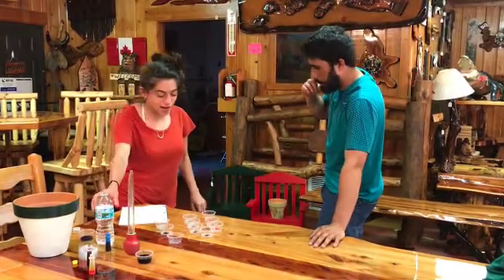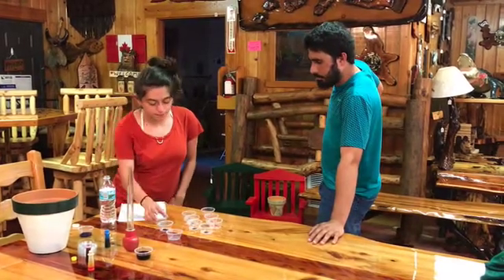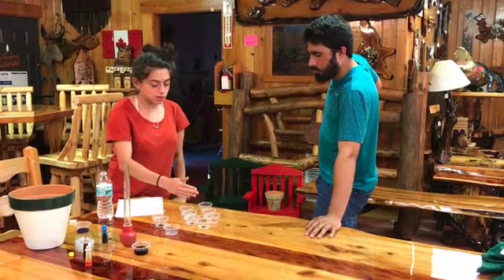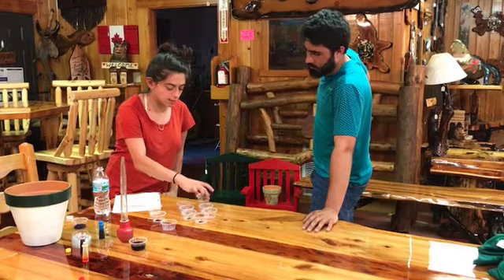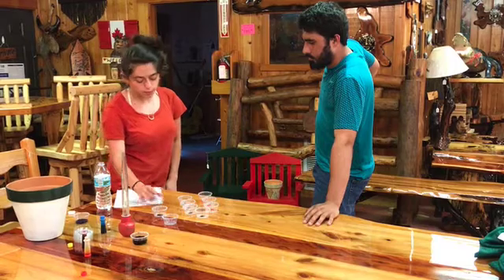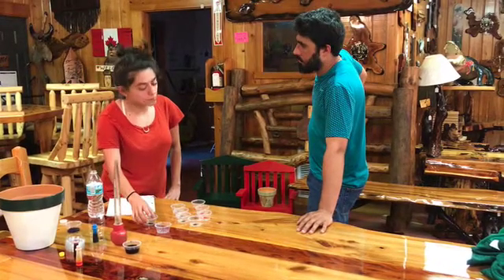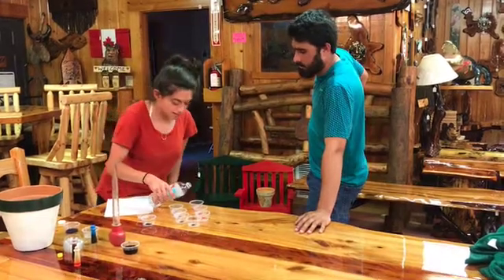So like I said, we're going to add the 20 microliters after the 1 ml of Bradford reagent. For these 7 protein standards, we're going to add 20 microliters of each protein standard. So like for the first protein standard, 20 microliters of it, 20 microliters, 20 microliters, etc. And then we'll add 20 microliters of PBS into this cuvette to serve as our blank. And then we'll add 20 microliters of our sample into this cuvette to test. So let's go ahead and do that.